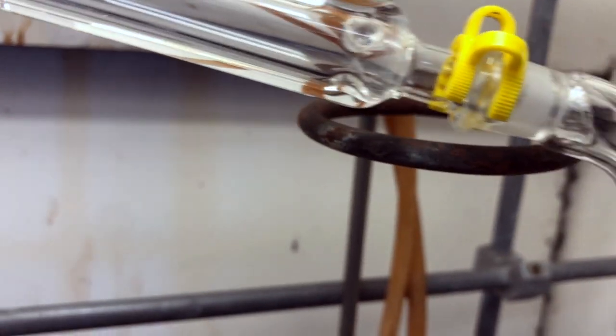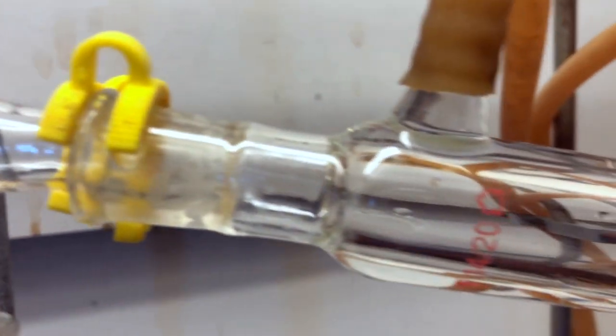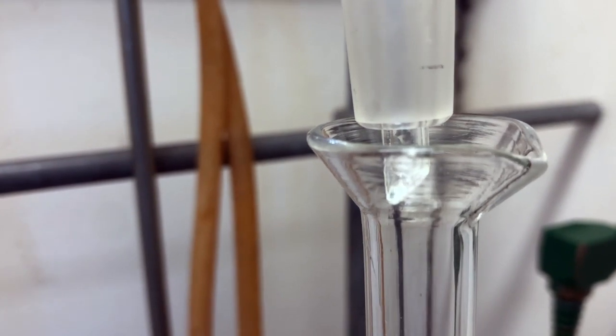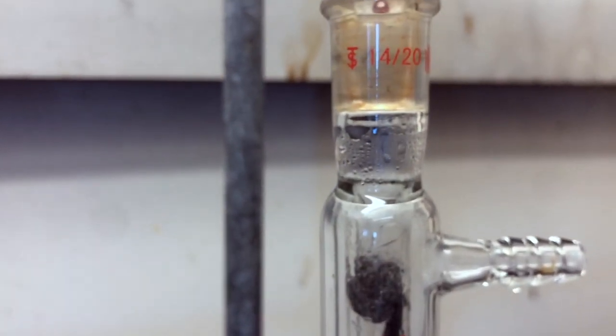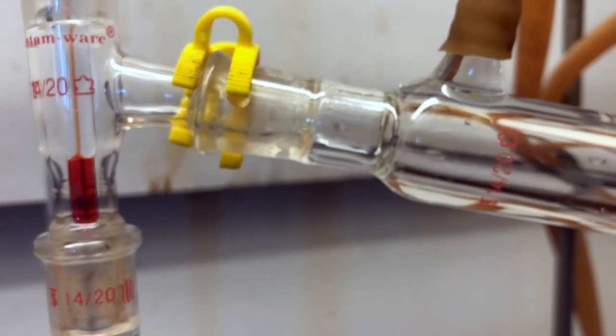The first drop comes in at 75.5 degrees — forming very slowly, at only one drop every 5 to 10 seconds. Even now, we can't see much dripping off the thermometer or much condensation in the distillation head. This is actually a good sign because it means we are keeping water out. Water would form those thick droplets we would normally see, but we are not seeing much water at all coming over at this point.